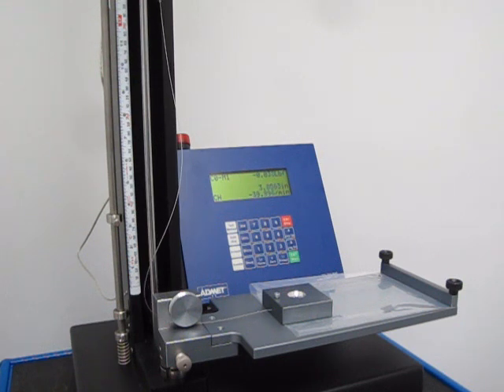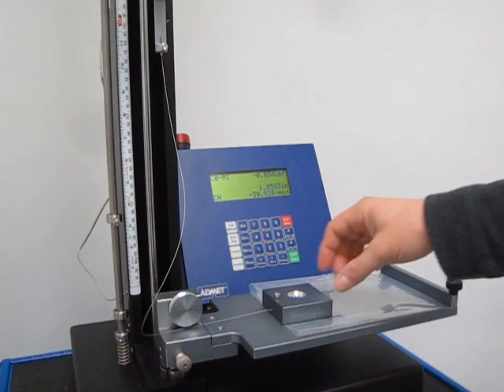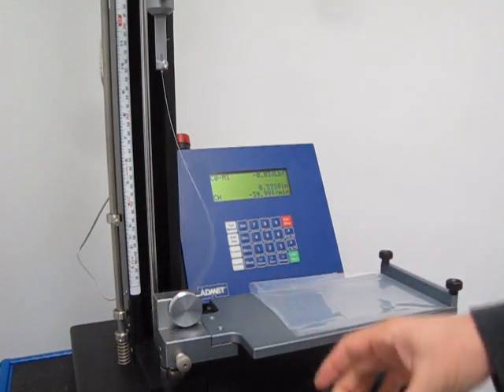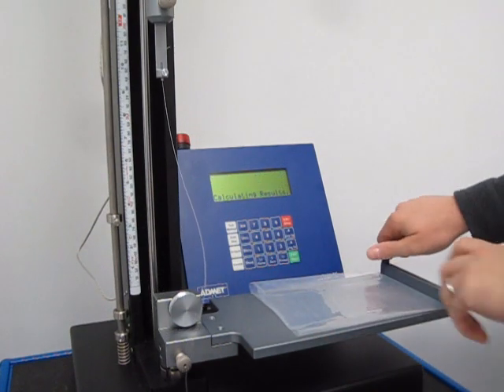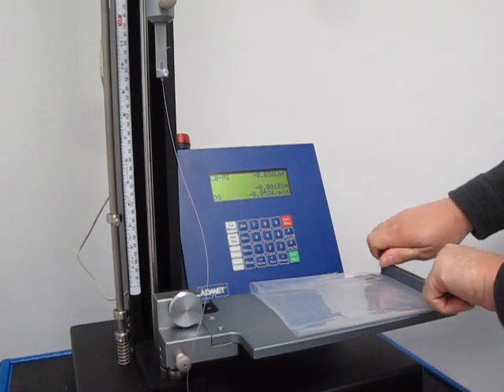When the test is done, the machine goes back to home. You can take the sled away and take out your sample.